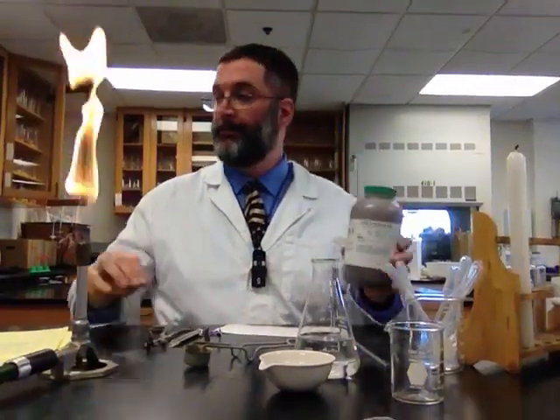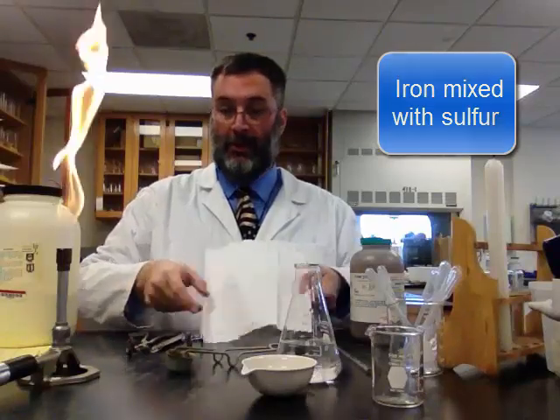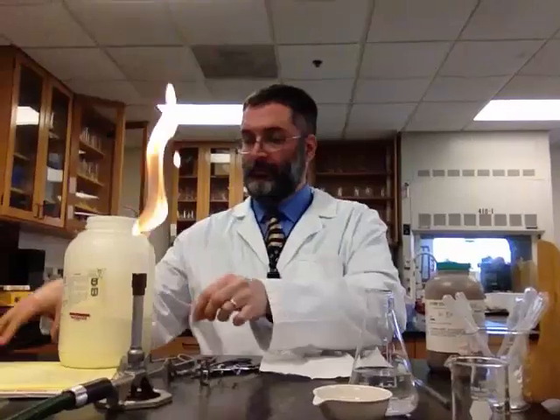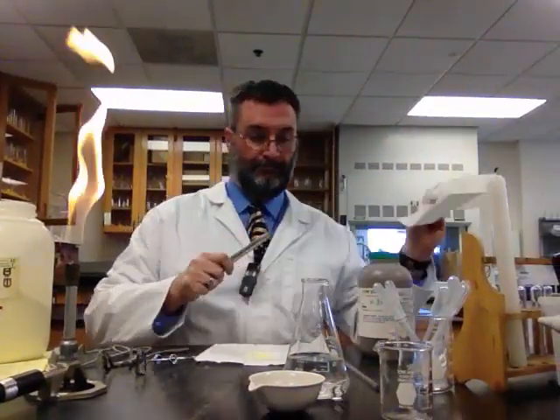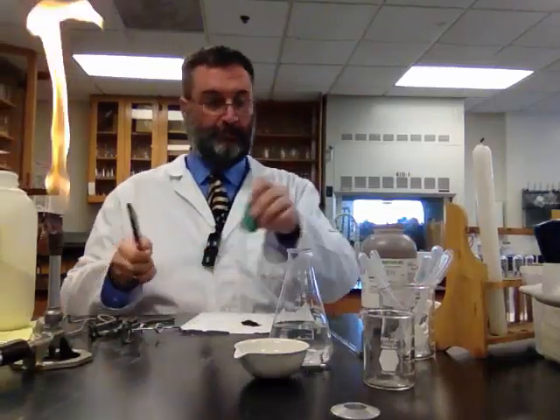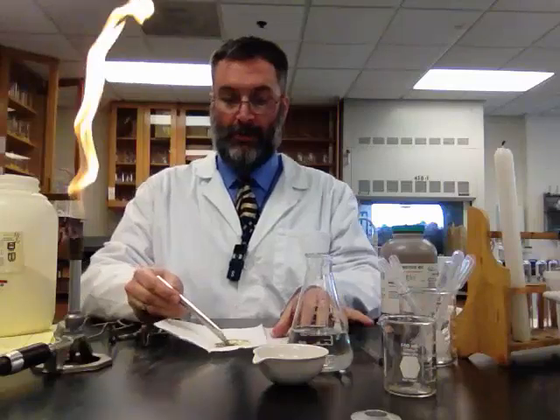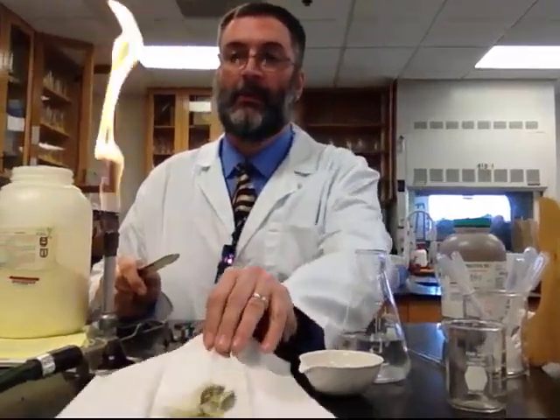Okay? So we're going to start with a very simple one. I have a bottle of powdered iron here, and a great big bottle of powdered sulfur. Paper towel. Powdered sulfur. Powdered iron. See if we can show you this a little bit closer. This is the change that I've done here. I've mixed together some powdered iron and powdered sulfur. This is what it looks like.